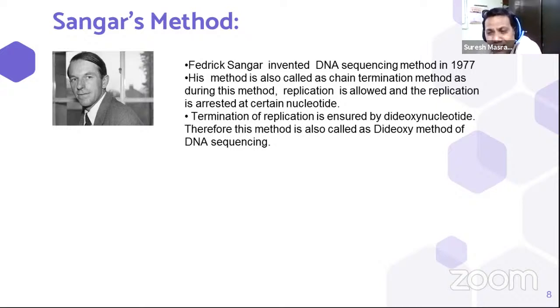And he also manages to make this DNA visible over the X-ray film.